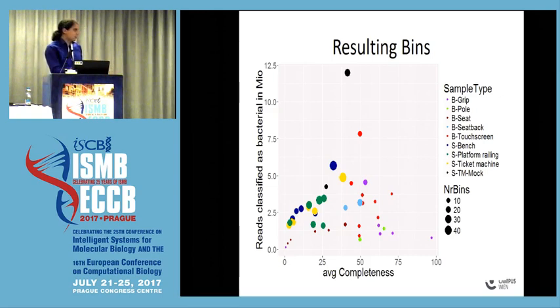What you can see here as well is that in terms of assembly statistics from the single samples, these N50 values and so on, which are very often used, were actually consistently worse in the Sacramento samples because the diversity was much higher, and that basically disturbed my high quality bins. But nevertheless, I was able to get very high quality bins, and with those I can then do further analysis.